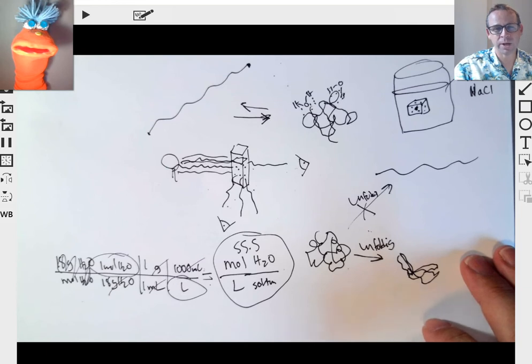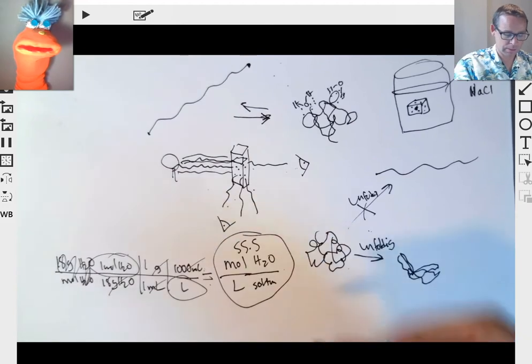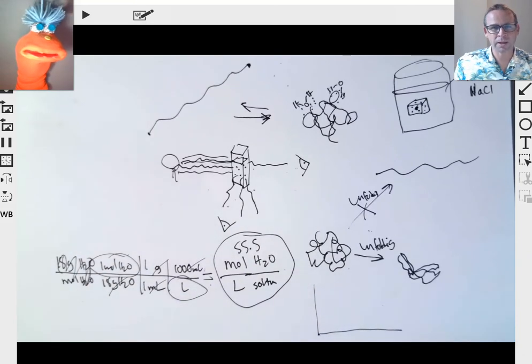Now, the protein fluorescence shift based on a protein's unfolding is not always predictable. After you've run the experiment once, then you know. But sometimes the protein will increase in fluorescence when it's unfolded, and sometimes it will decrease in fluorescence when it's unfolded. Now, if a protein increases in fluorescence, what are some reasons why that increase might be occurring when it unfolds? The tryptophans are more available to absorb and emit light. Very good. So unfolding, the tryptophans might be more available.